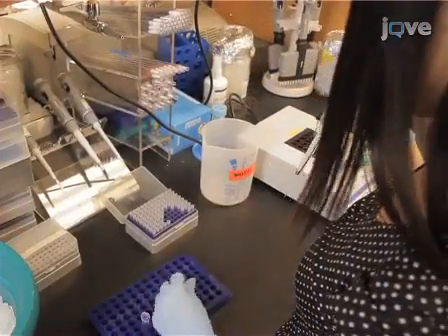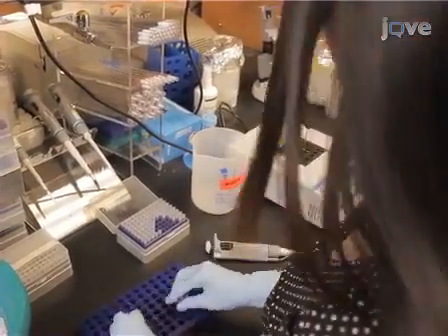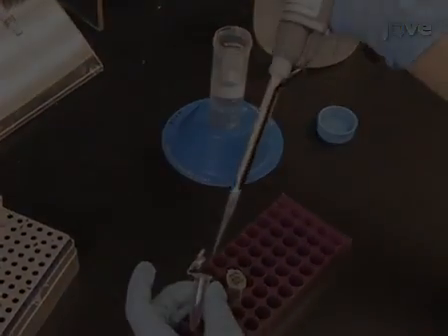To linearize Rag2-C-MYC and Rag2-GFP DNA constructs, digest 10 micrograms of each plasmid with restriction enzyme NotI at 37 degrees Celsius overnight. After phenol-chloroform extraction and ethanol precipitation, resuspend each plasmid.